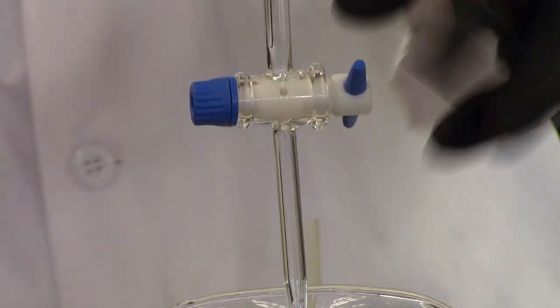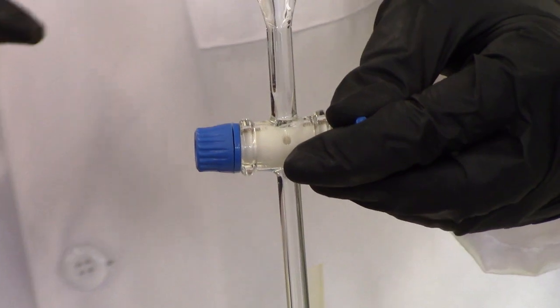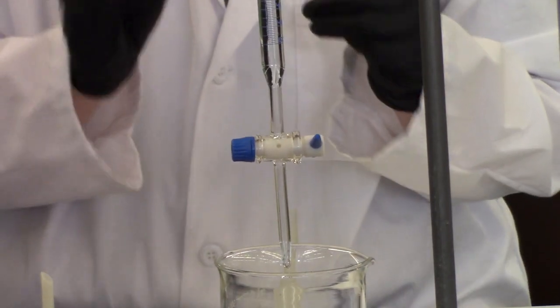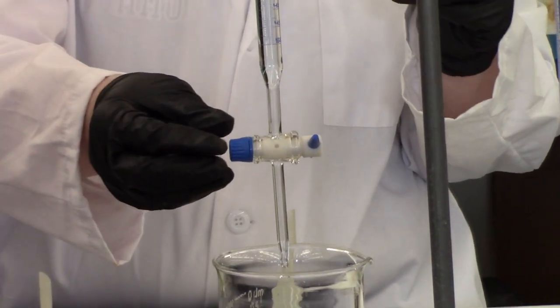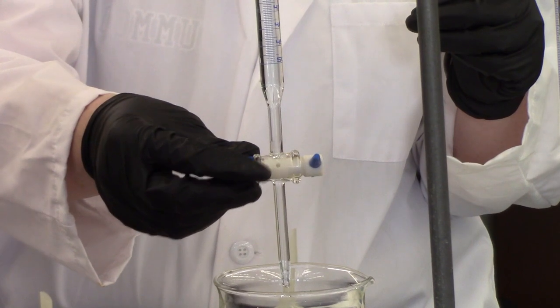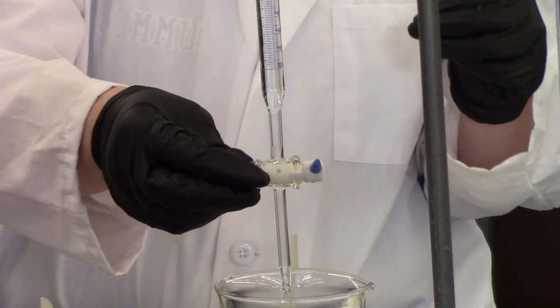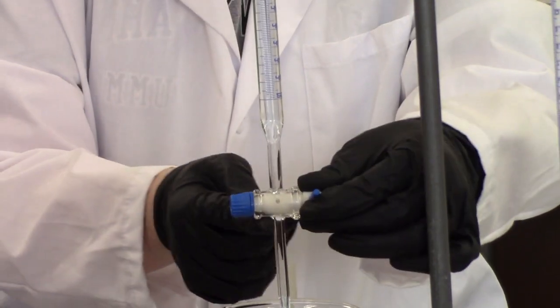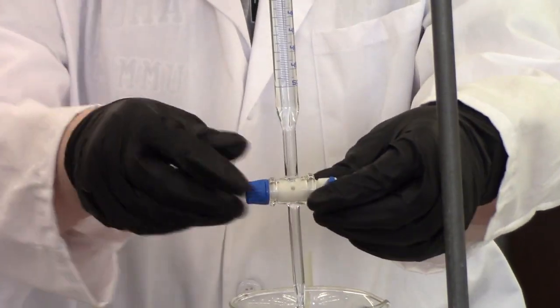Some tricks. You can just let it flow for a few minutes. In this case, that worked. Okay, just a couple seconds, really, not even minutes. Sometimes the bubbles will be stubborn, and you might need to adjust the pressure here. Seek help from your instructor in that case. You don't want it to be too loose because it'll leak out. You don't want it to be too tight because it's hard to turn. And if it's too loose, air bubbles will come in from the side and accumulate right there anyway.